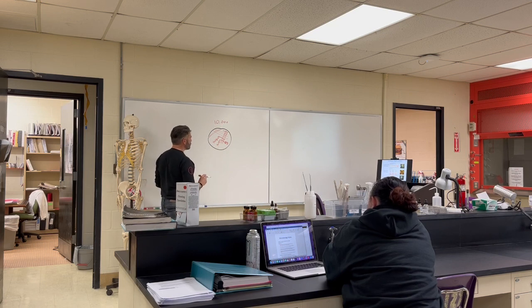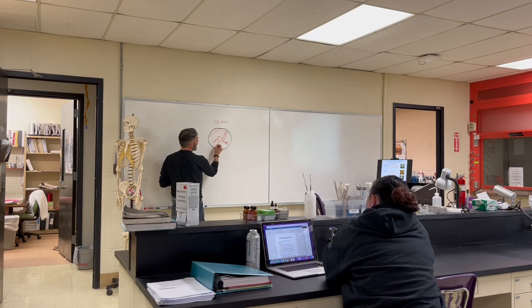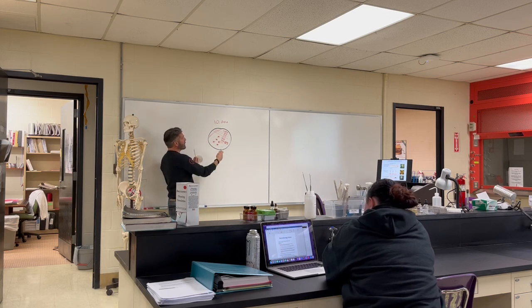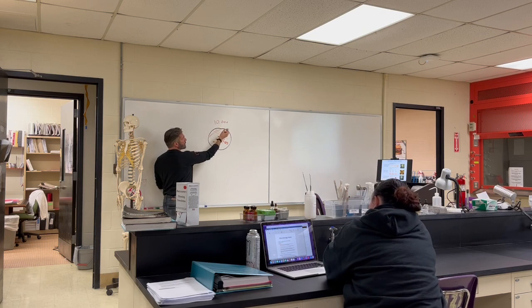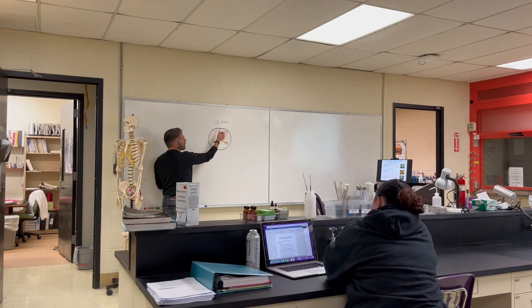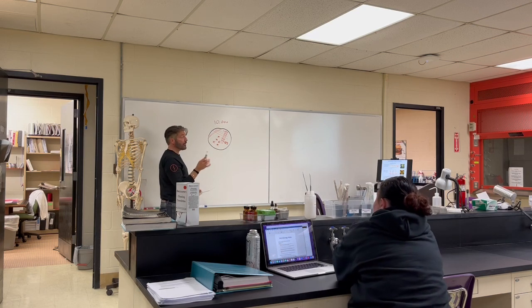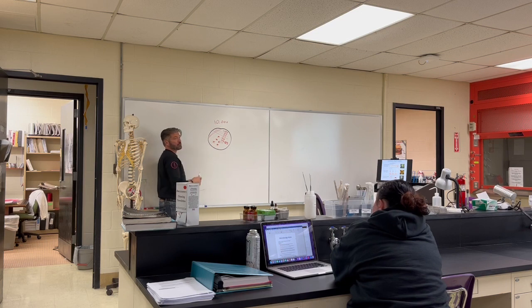Now, next week when I come back, in theory, this should be from one bacteria, this from another bacteria, and so on. The swab lines you won't see. So in theory, I went from swabbing this, I had 10,000, sterilized it, 0, swiped it through here, about 1,000, came through here, maybe 23, sterilized it, and as I brought it through here, I dropped off 1 bacteria each. And if they're going through binary fission, in theory, these should be absolutely identical.